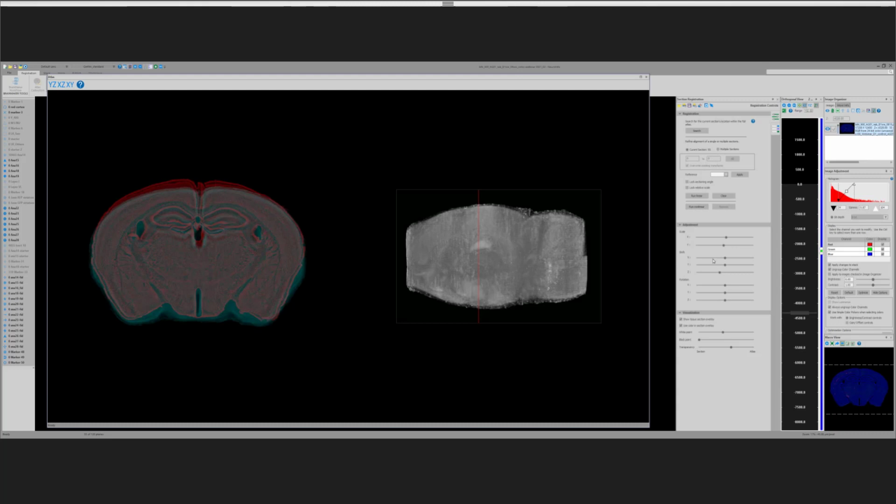When we get to this point, individual brains vary in terms of the XY scaling. That just happens. So we can move the brain itself. Now we're moving the Allen space relative to where the experimental brain is. We can move in the y-axis, and in the x-axis.